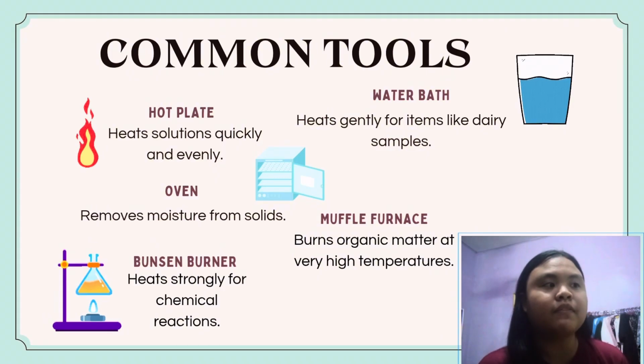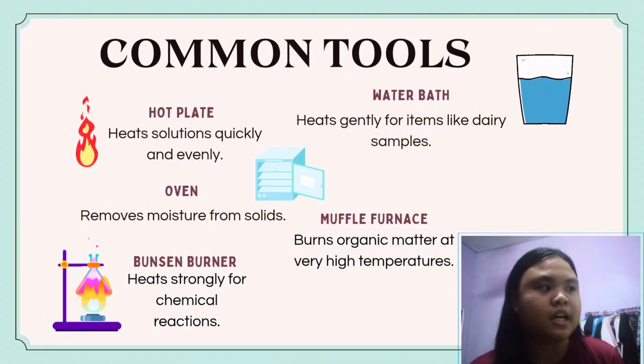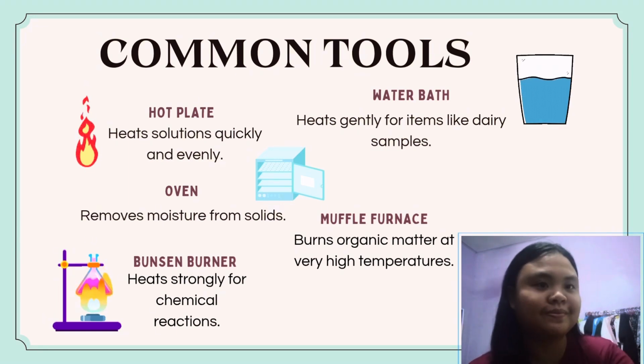Finally, the muffle furnace. This one's heavy duty. It burns organic material at very high temperatures and is used in environmental labs, especially to test soil samples for metal contamination after all organic matter is removed.